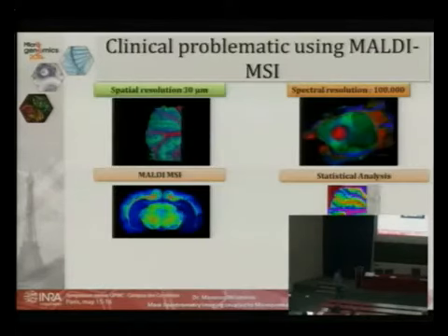There was a lot of development done on these techniques, and we can now achieve images with spatial resolution near the size of a cell. Current instruments can realize images at 1 micrometer for small molecules.